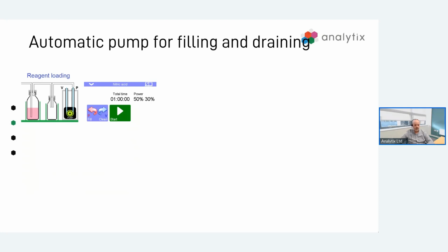So the way these pumps work is the same for the subclean as it is for the subpure and duopore. It consists of 3 components really. So on the left of this schematic, you can see a filling bottle. This filling bottle is what will actually contain the acid that you're wishing to distill. So this is placed in there and capped, and then it's connected to the pumping system. And in between here is what we class as a buffer bottle. The buffer bottle's main need is just to protect the pump system.